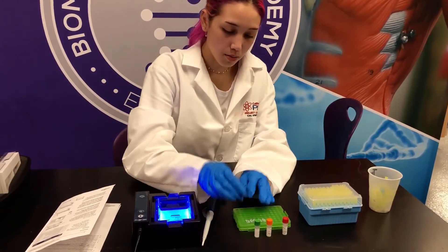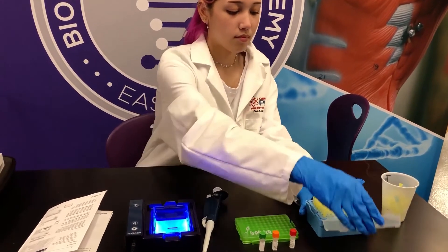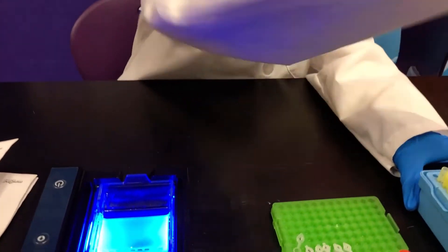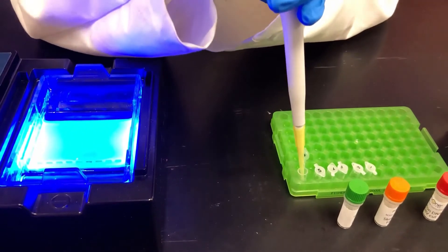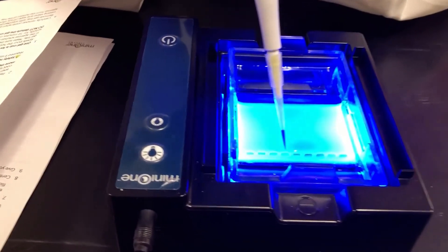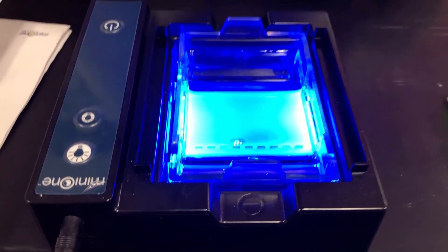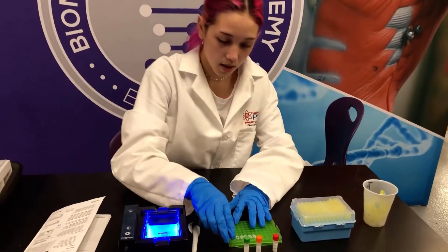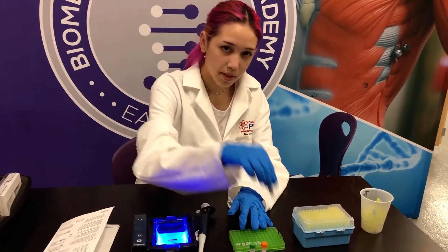Now tube six. Close that and the other one.